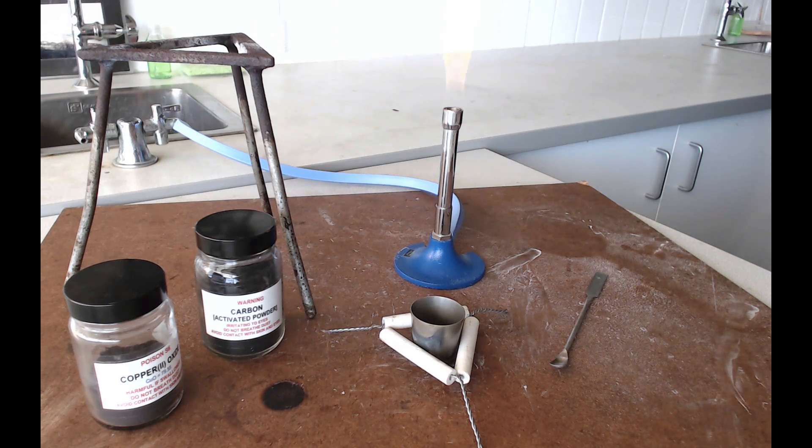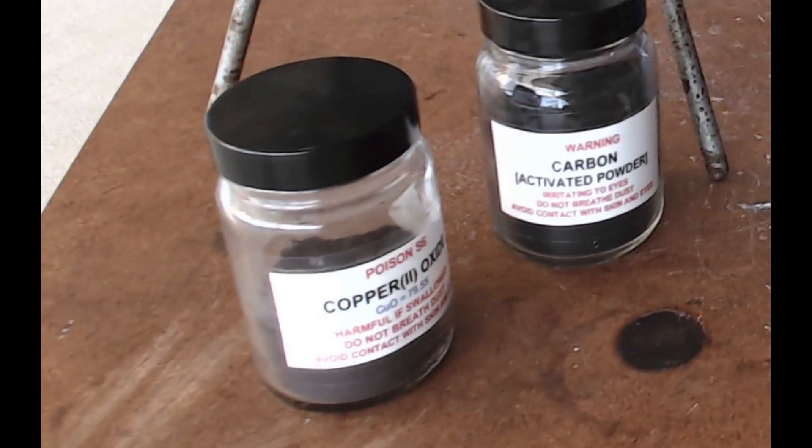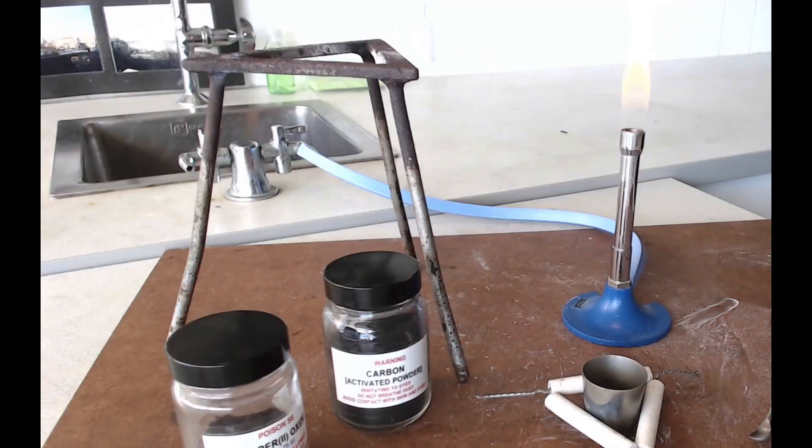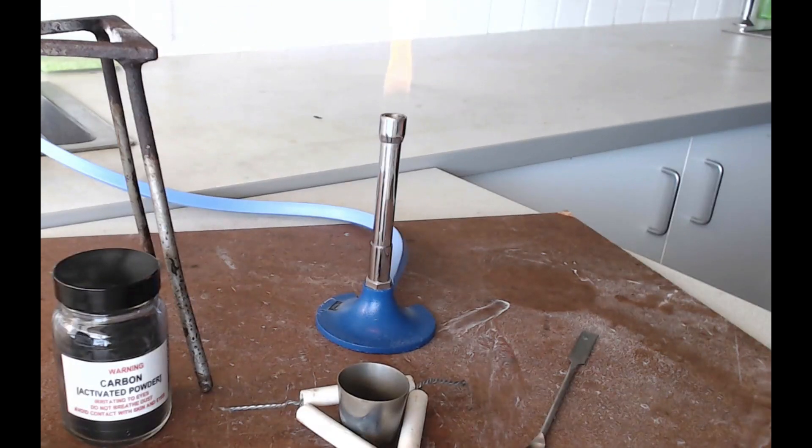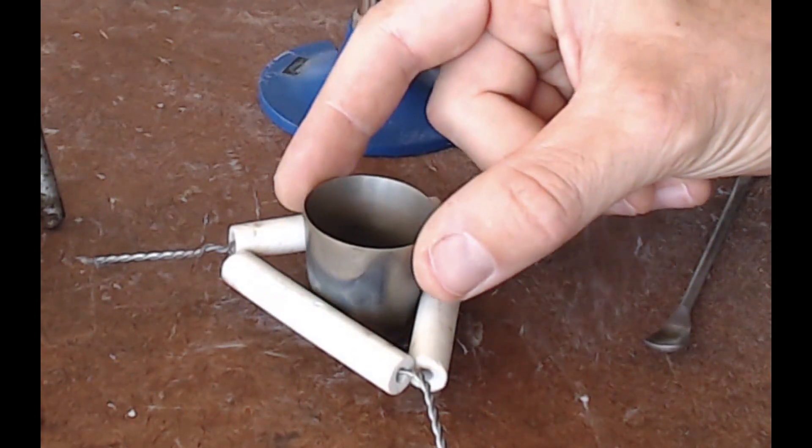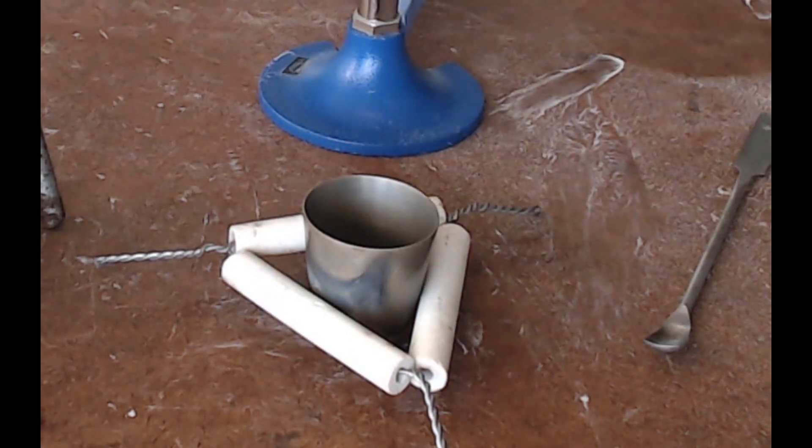For this experiment you need some copper oxide powder, some charcoal powder or powdered carbon, you need a tripod, you need a Bunsen burner, a pipe clay triangle which you're going to stand your crucible in. So you need a crucible and you need a spatula.